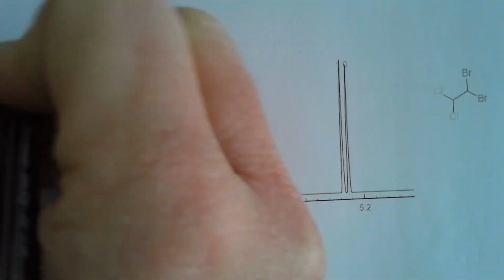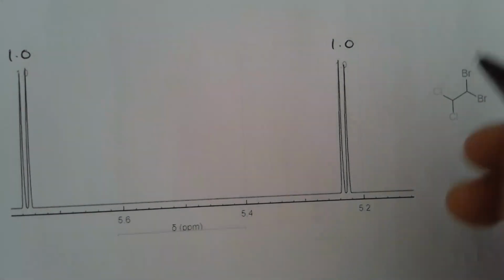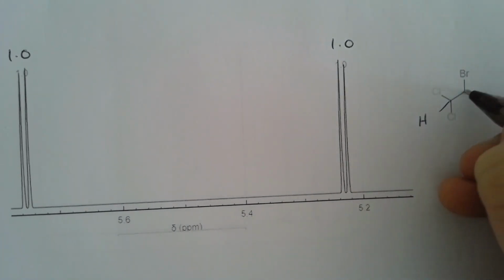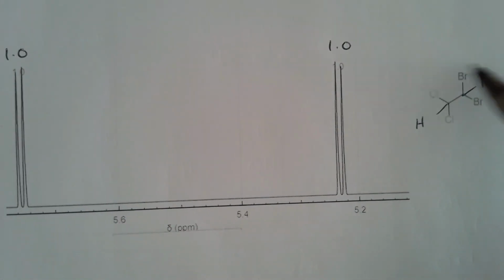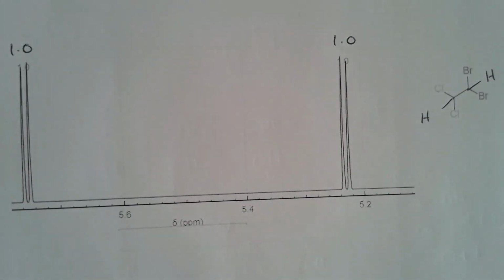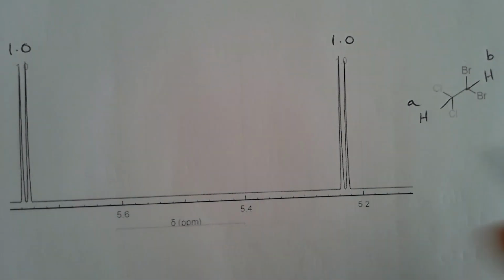So let's have a look at this second compound here. You might not be able to see it very well, but there's 1.0 and 1.0 over there. That's just that integrated trace telling us that it's got 1 hydrogen in the environment. Here's our molecule. We've got a hydrogen here and a hydrogen here. They're not equivalent hydrogens because of these different groups on here. So let's call this one environment A and this one environment B.